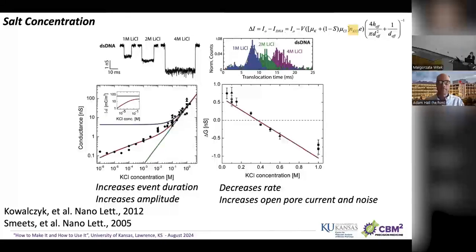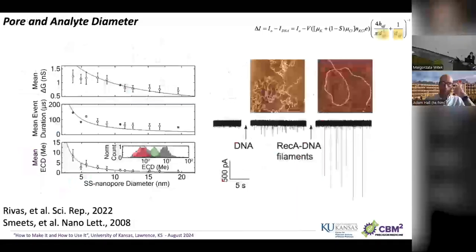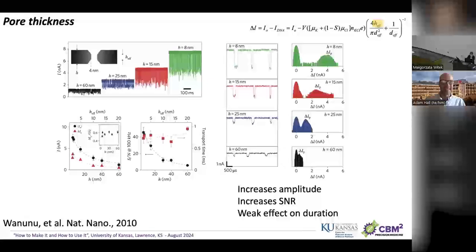Okay, thank you, Dr. Paul. My second question is, you showed the effect of the membrane height, the H, on the signal-to-noise ratio. Oh, sorry, too far. I apologize. No problem. There it is. Here, you said that the thicker the membrane is, the lower the signal-to-noise ratio, and vice versa. So does that have to do with the electric field drop or electric field strength? What causes the signal-to-noise ratio to increase as we make the membrane thinner?